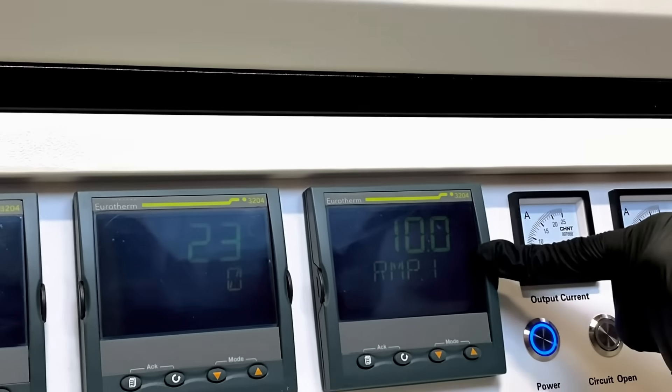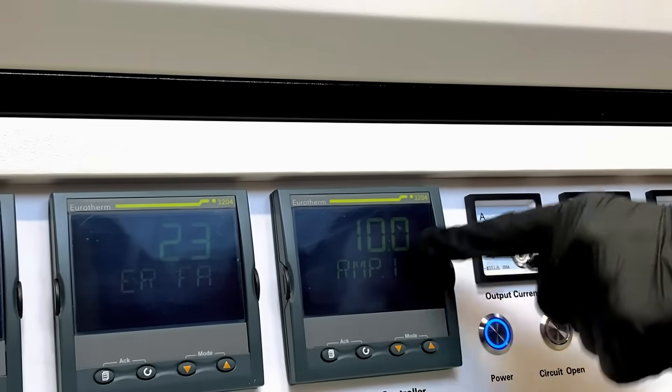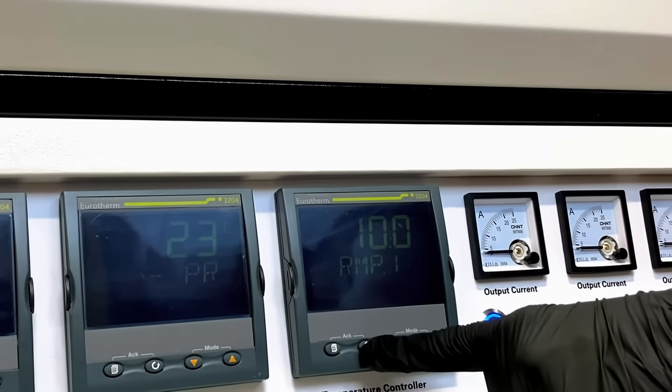And then, above 1,200 Celsius, we reduce our recommended ramp rate to 5 degrees Celsius per minute. Right now, we will set 10 degrees Celsius per minute and press the cycle button.